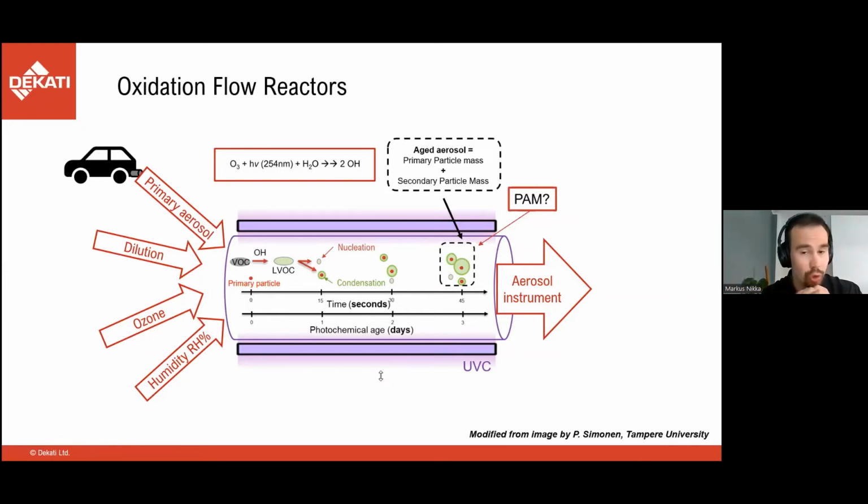Yes, you can use it for both, of course. I'm just using the vehicle emission as an example. There are some key benefits in the DOFR that makes it quite good for, for example, the engine emission, vehicle emission measurements. So that's one of the reasons why I use it as an example. But we go to the details of the instrument next.